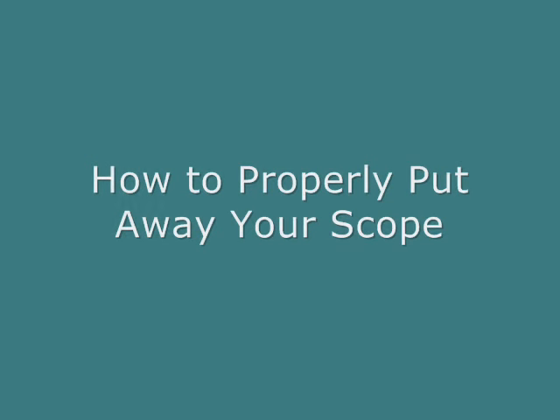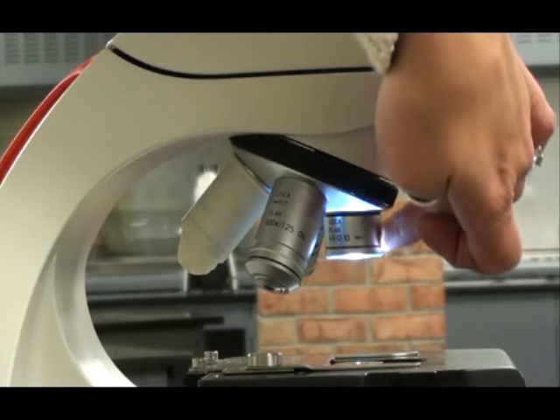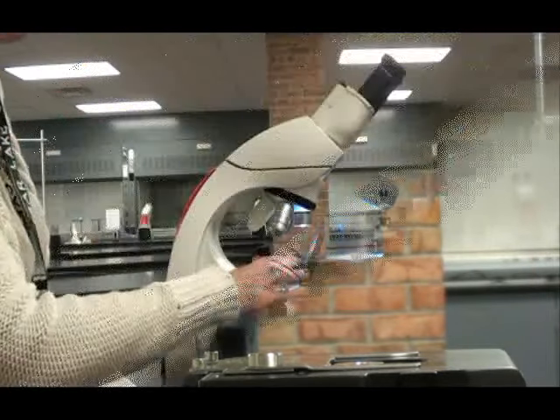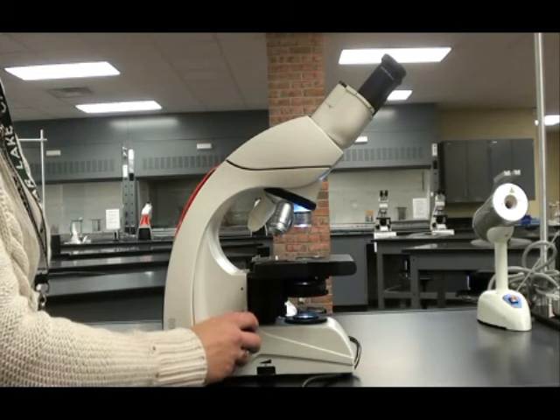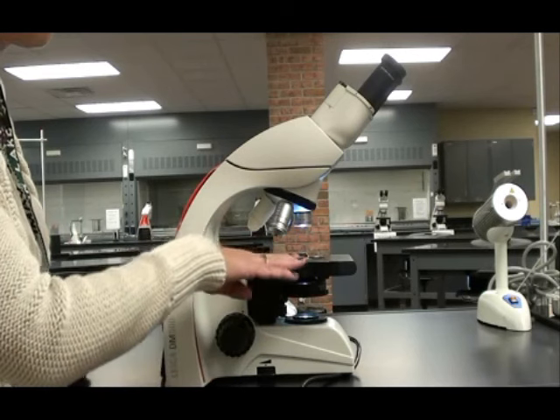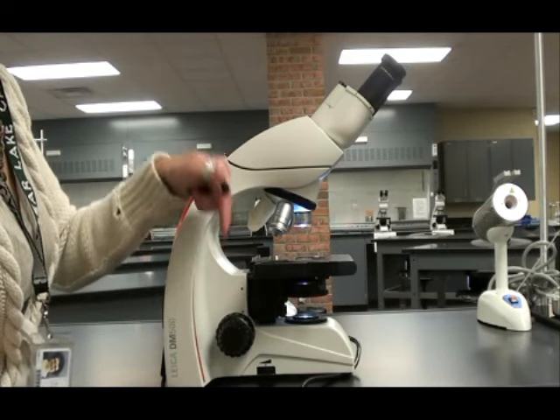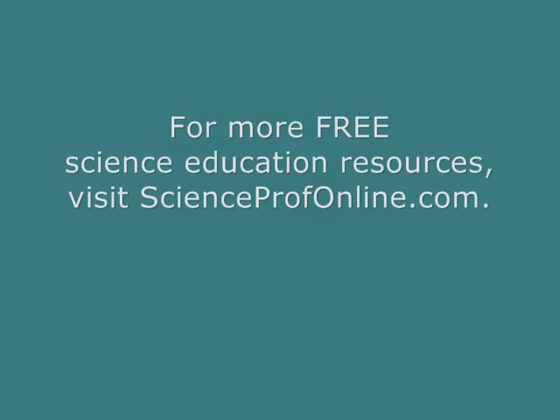When you are all done, it's important to put away your scope properly so that it won't get damaged. You do this by making sure that the shortest objective lens is pointing down, the scanning power. Then you dial the coarse focus down all the way to lower the stage as far as it can go. This way, we know that the lens is not going to smash into the stage. More seriously nerdy, amazing free stuff at ScienceProfOnline.com. Go there!